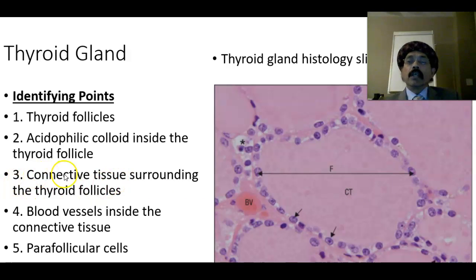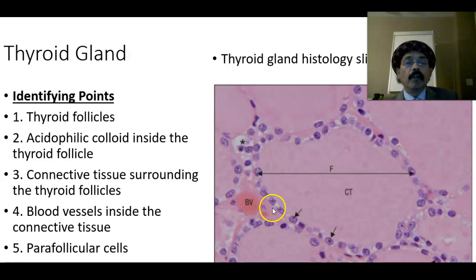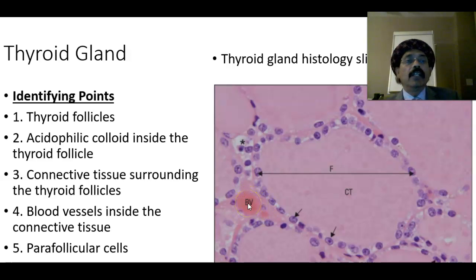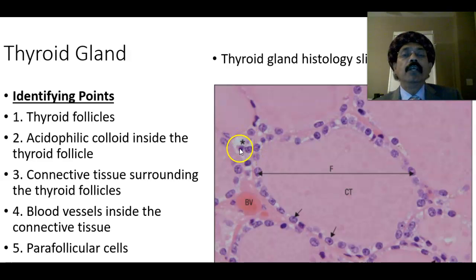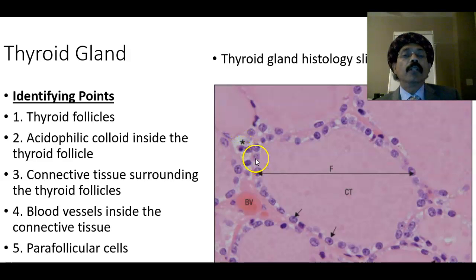The connective tissue surrounding the follicles is rich in blood vessels and reticular fibers. These are fenestrated capillaries. We have parafollicular cells at the periphery of the follicle. Parafollicular cells are also called clear cells because their staining is light, and they are slightly larger than the normal cuboidal follicular cells of the thyroid follicle.